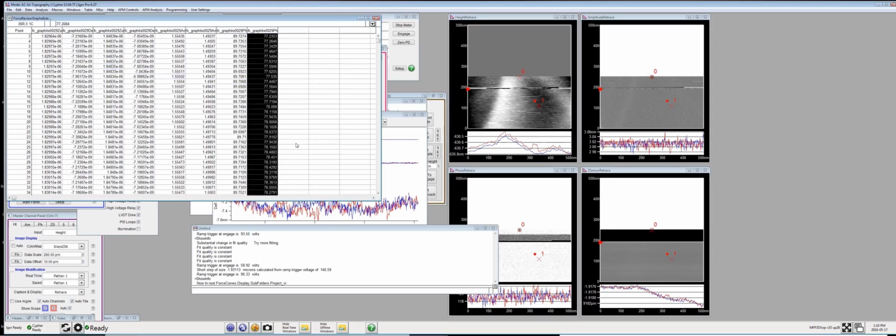This is why it makes it very good to work with MATLAB. The problem being, MATLAB doesn't like this type of data here. So if we want to collect this data and throw it into MATLAB, we should put something here, say zeros, or we can just delete that and convert it into a full matrix. So all columns should have the same number of elements.